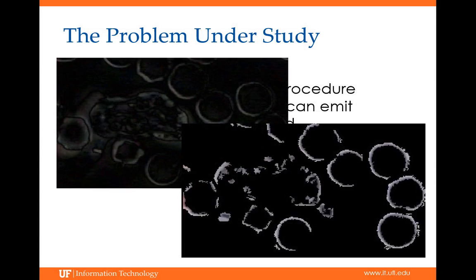We can see in the following pictures, the top left one is the original picture, and the other one is the picture after we do the background subtraction. We can see there's a huge difference between these 2 pictures. In the second picture, there's even illumination, and there's less cell debris, which is much better for detecting than the former one.